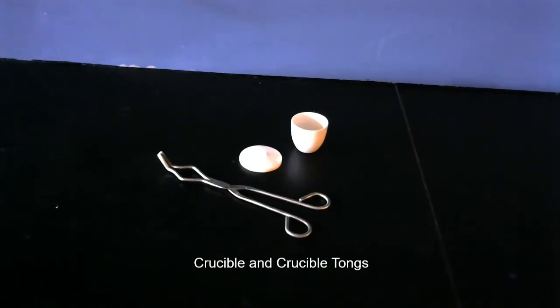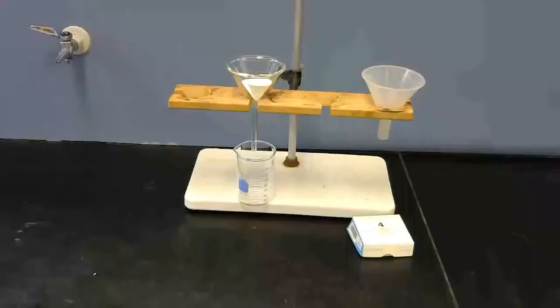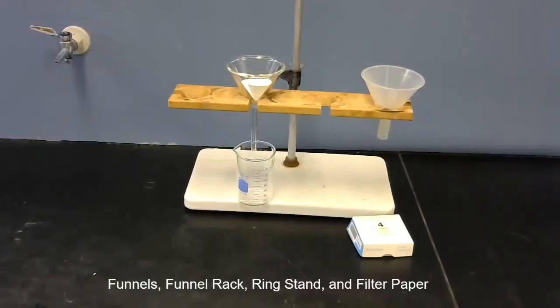Here we have funnels and a funnel rack with a beaker underneath, all mounted to a ring stand. One of the funnels has some filter paper in it, and you can see the box of filter paper there.